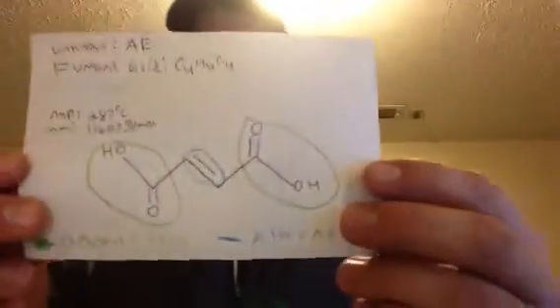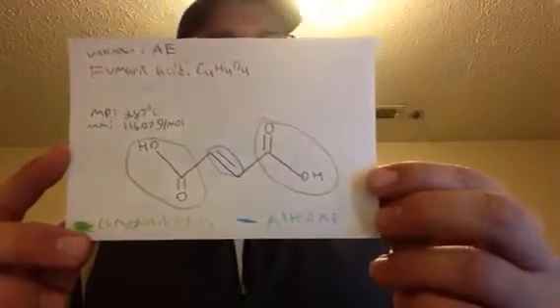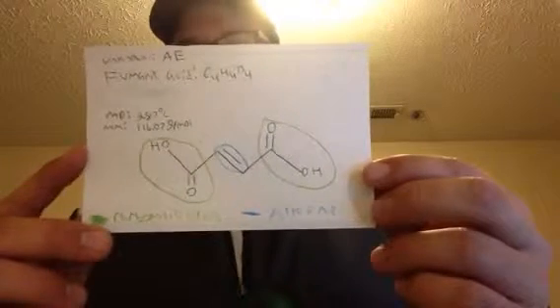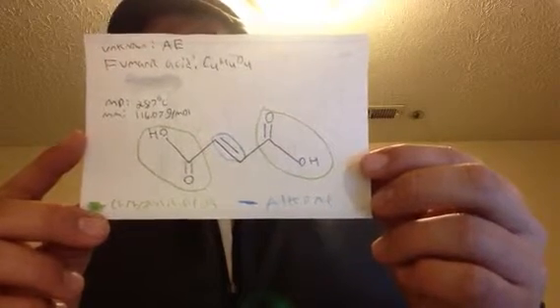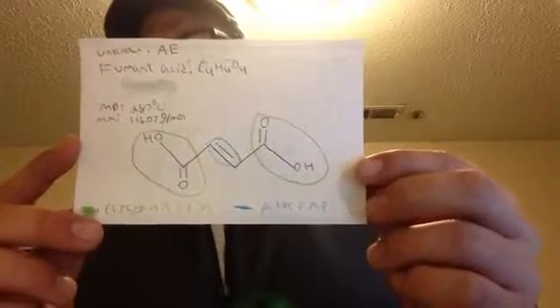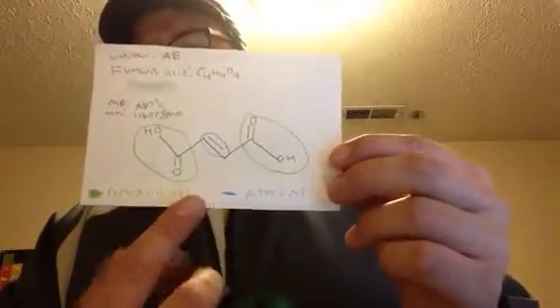For my experiment, I had unknown AE, and my infrared spectrum and my melting point showed that it was fumaric acid, C4H4O4, with a melting point of 287 degrees Celsius and a molecular mass of approximately 116 grams per mole. And as you can see, the structure there has 2 carboxylic acids and an alkene.